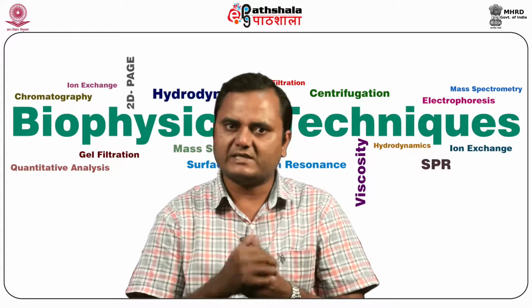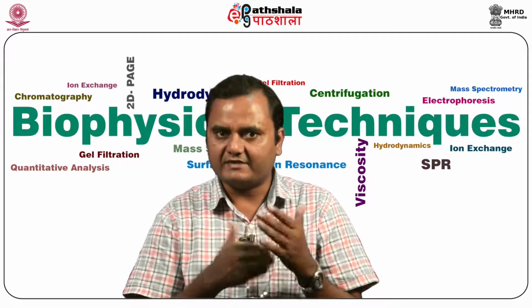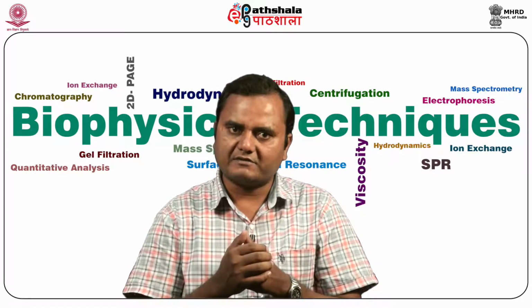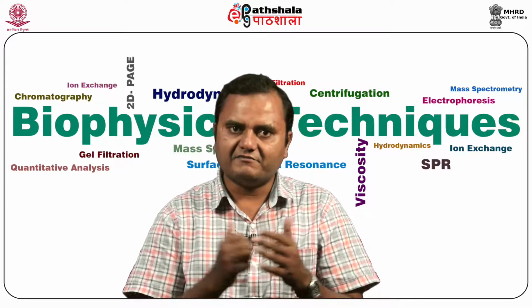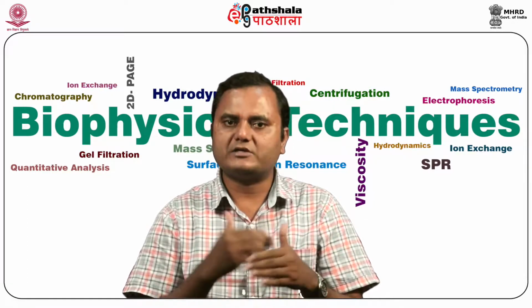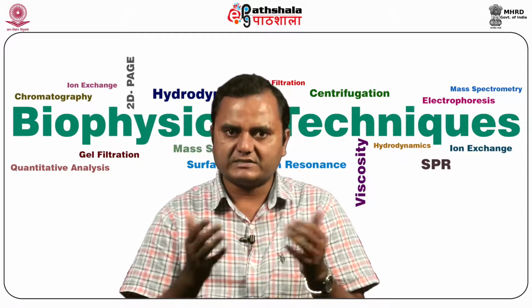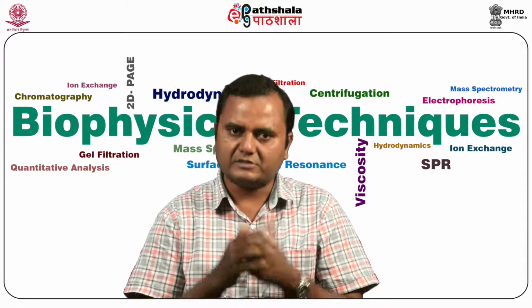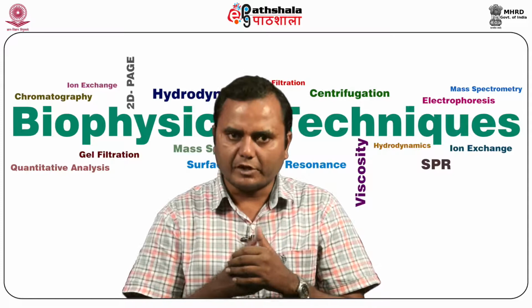A correlation should be established between the molecular weight and the S value. It is given as S equals molecular weight into 1 minus V rho divided by NF, where V is the partial specific volume of the solute and rho is the density of the solvent. N is the Avogadro number, that is 6.023 into 10 to the power 23, and F is the frictional coefficient of the solute.